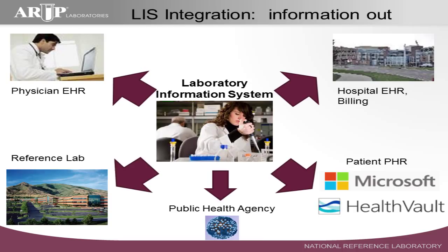Okay, so on to integration, data integration or information integration. So the LIS is not a standalone or an island of information. It has to share information in a lot of different directions. We'll talk about two directions. So data going out of a lab system goes to a lot of various different clinical information systems in the healthcare arena. By the way, a little note, might be interesting to some of you, that probably the oldest clinical information system out there is a laboratory information system. And you could probably imagine why.